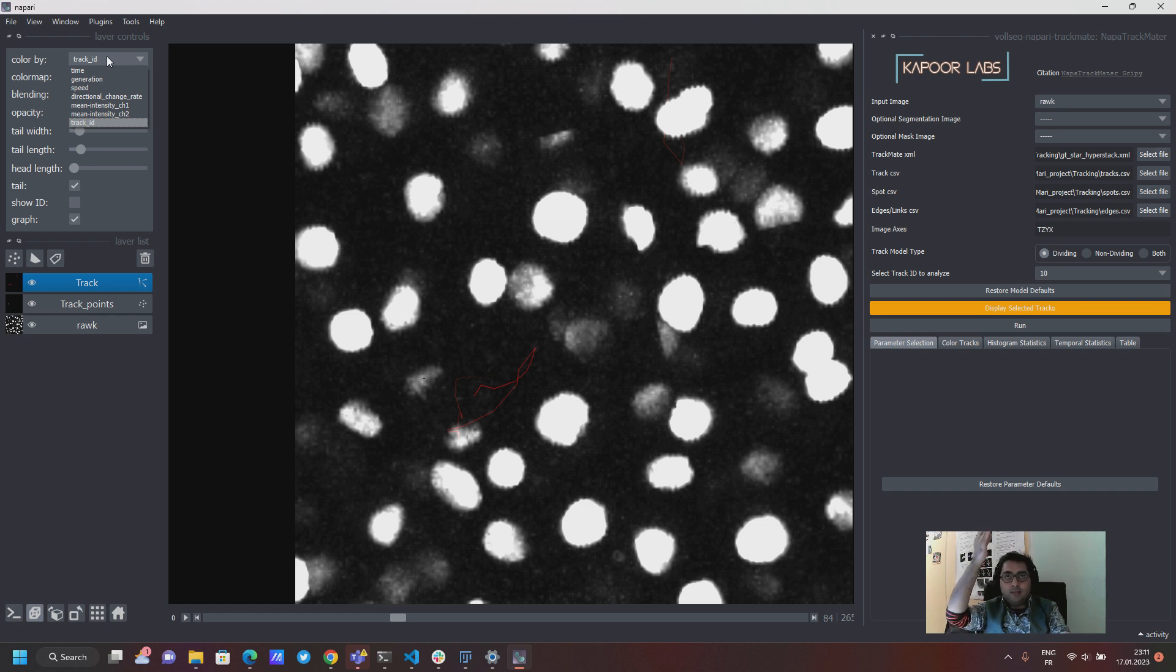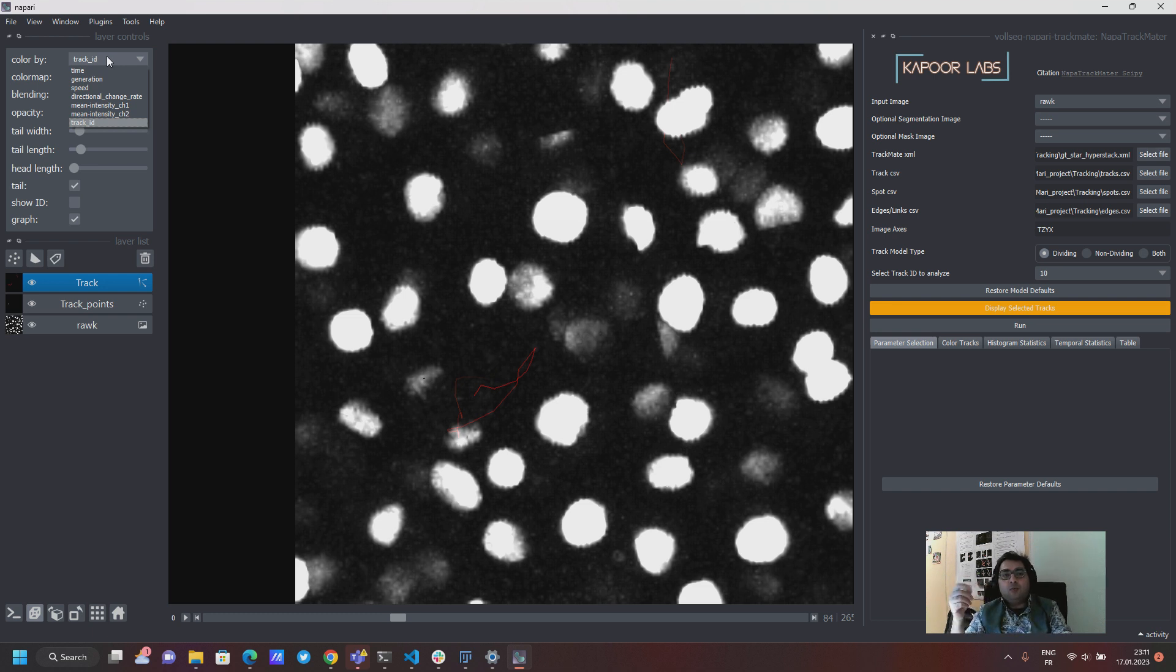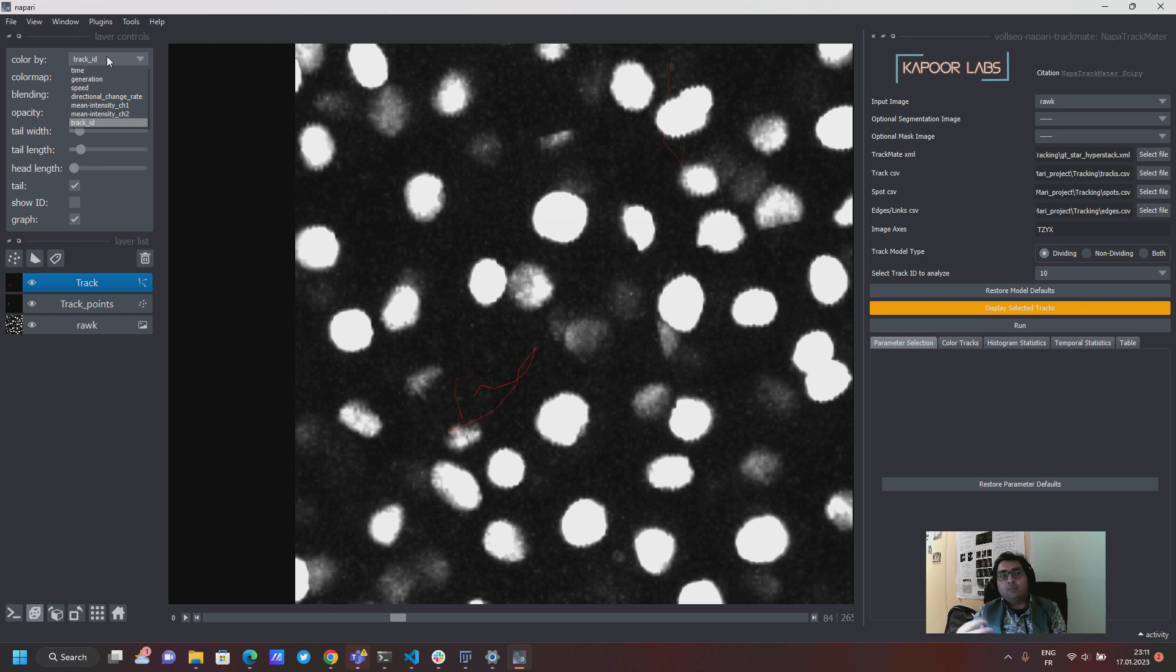If it divides the daughter cells become generation one and if the daughter cells divide they become generation two and so on.